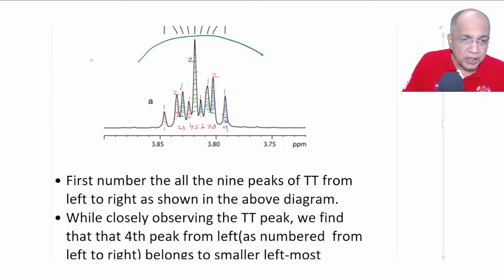It is between the adjacent components of an individual triplet. So it is 1 to 2 or 2 to 4. We already know that 3 is belonging to the middle triplet. So 1 to 2, then 2 to 4 is another value. Then 3 to 5 is another value.